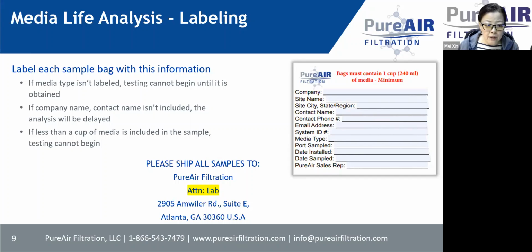And I need to highlight that a sample without proper label cannot be tested. Either we get information from you later, but that takes time, and so your sample analysis will be delayed, or sometimes people don't have any information they can track, so they have to do a second round sampling, which takes another maybe 1 or 2 weeks to ship the sample, and we're going to put you on the lower queue to finish the sample in the lab, because we handle hundreds and hundreds of samples every month. So please understand, every customer is important to us.